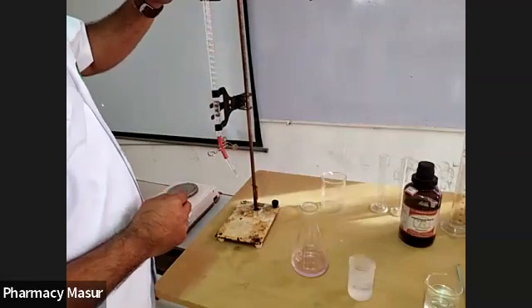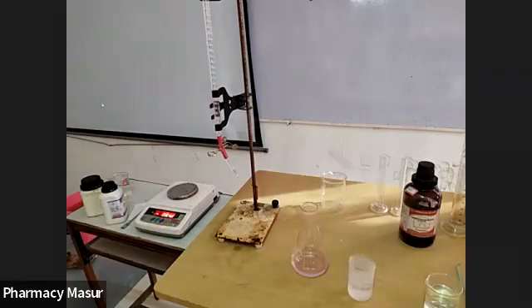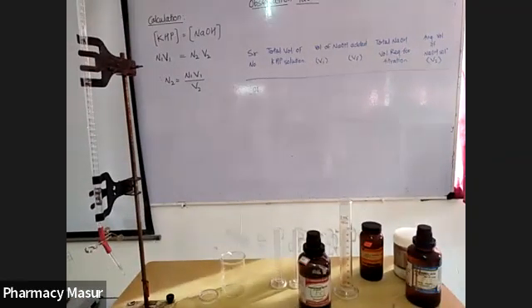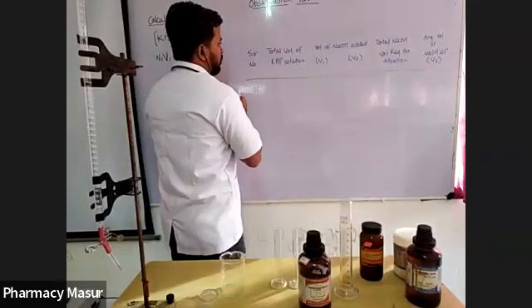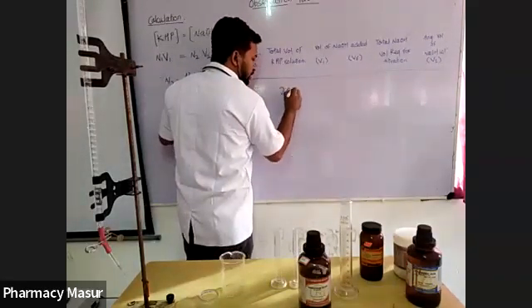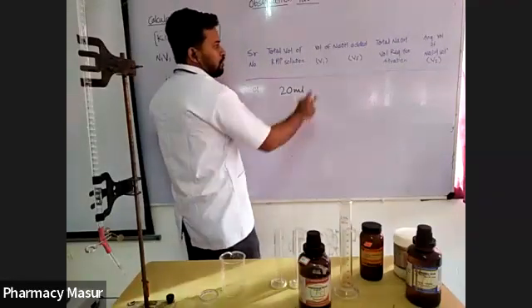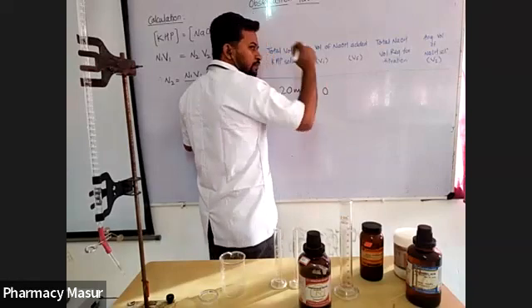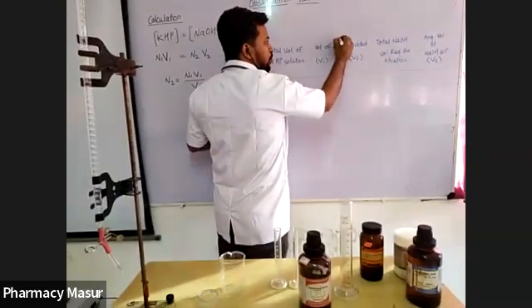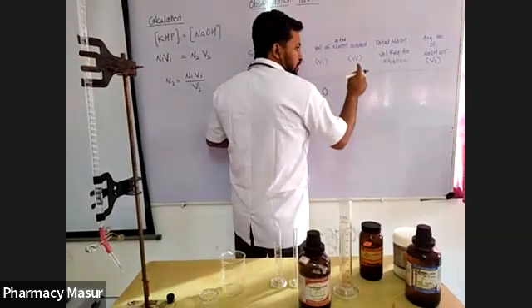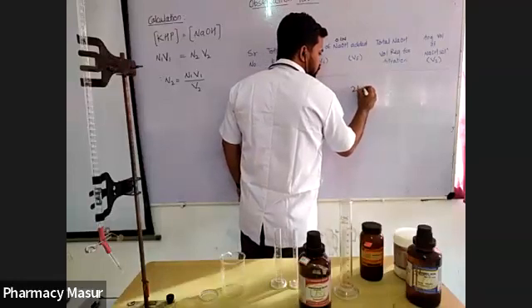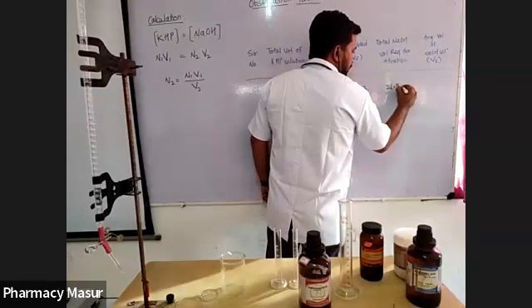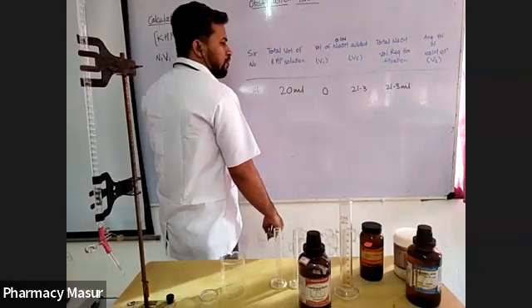You can see the burette reading is approximately 21.3 ml. So after addition of 21 ml of NaOH, we get the first titration value. The total volume of KHP solution added is 20 ml. The initial burette reading for 0.1 normal NaOH is 0, and after the endpoint, the reading is 21.3 ml.